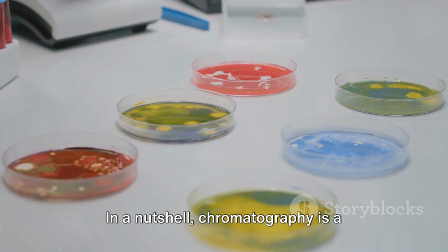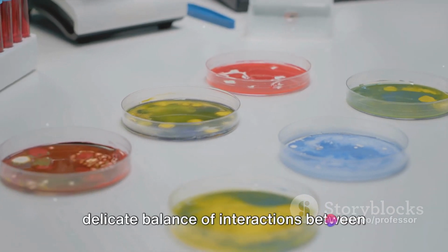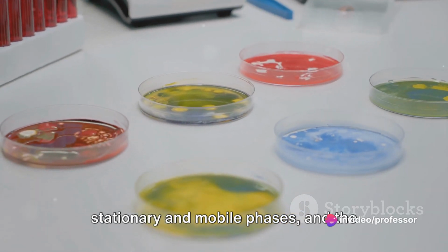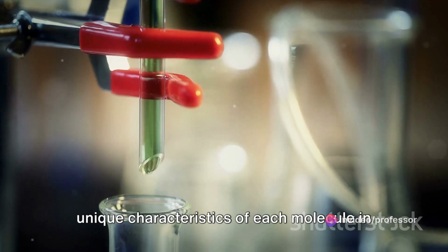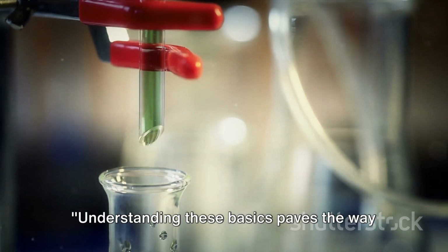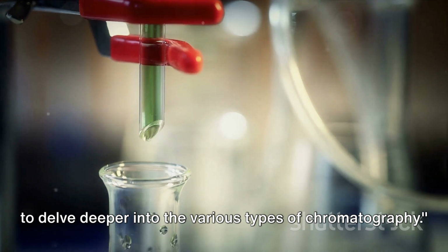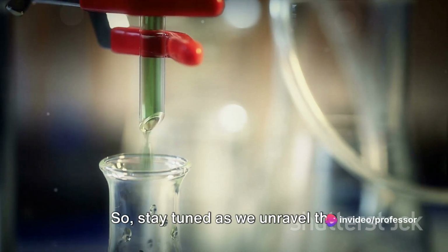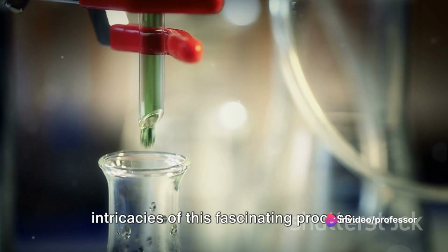In a nutshell, chromatography is a delicate balance of interactions between stationary and mobile phases, and the unique characteristics of each molecule in the mixture. Understanding these basics paves the way to delve deeper into the various types of chromatography. So stay tuned as we unravel the intricacies of this fascinating process.